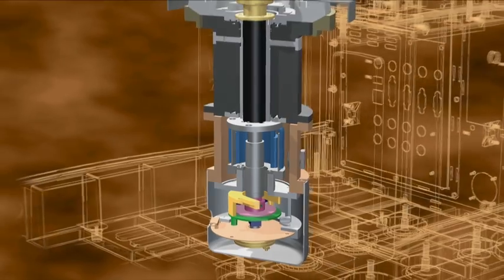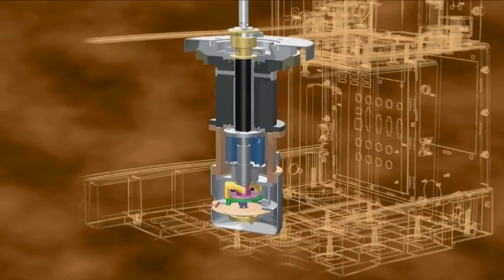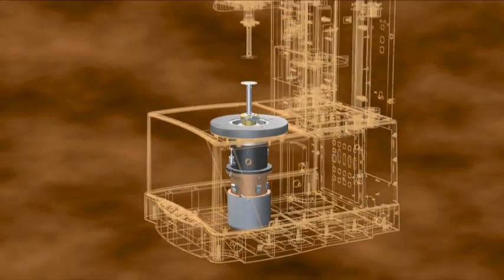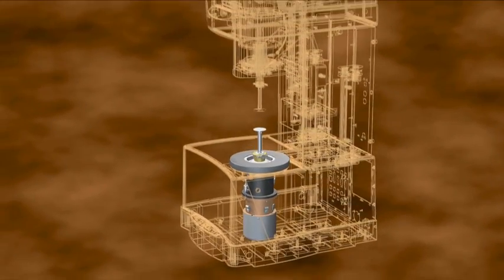Thrust and radial bearings provide frictionless rigid support with excellent concentricity and no axial run-out for superior shear and normal force measurements.